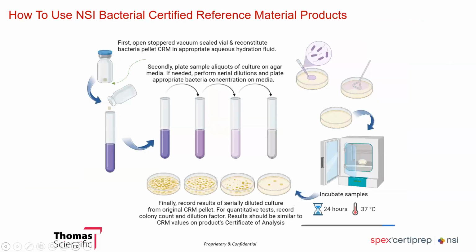And when you want to use one of these bacterial certified reference materials, you first open the vacuum sealed vial and you reconstitute the pellet in an appropriate hydration fluid. And then you make your aliquots before you put them onto your agar medium. And sometimes you'll need to make multiple serial dilutions to get the appropriate bacteria concentration on your media plate. And then you'll incubate your samples, and then you will be able to record your results.